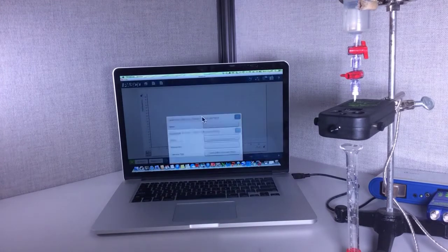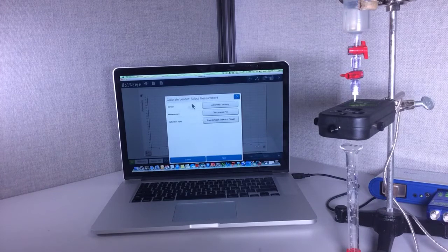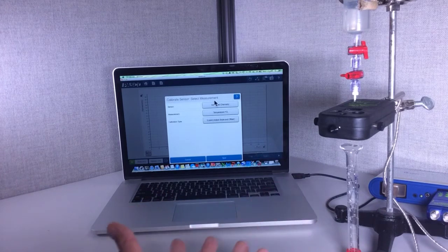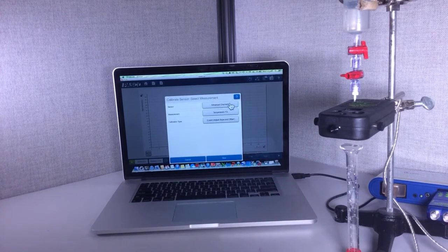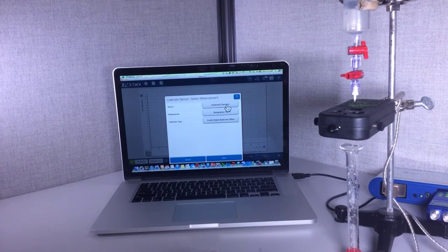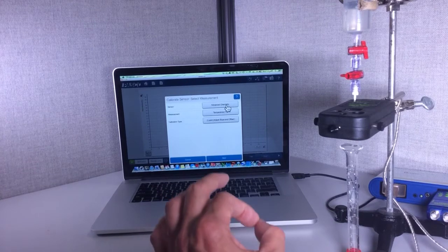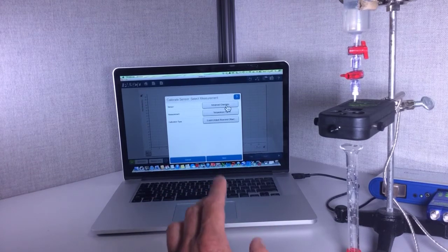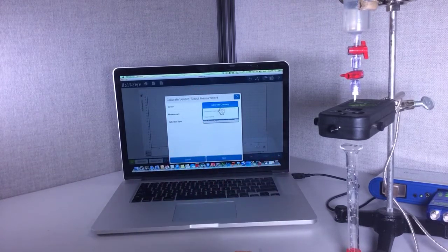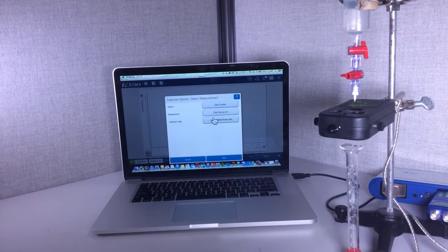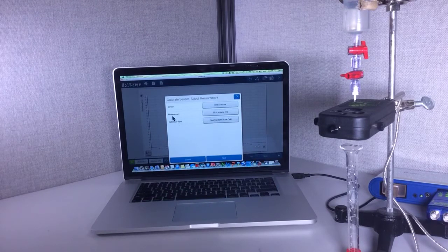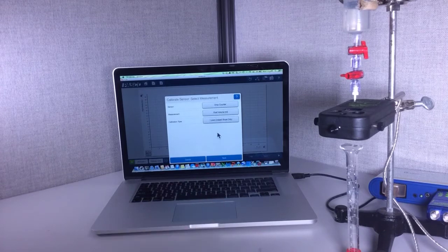I'm going to hit that and now it reads whatever sensors are plugged in. It's giving me the advanced chemistry sensor but that's not the one I'm interested in, so I'm going to switch that. I'm going to click on advanced chemistry and change it to drop counter. Now it says measurement fluid volume. This is correct.